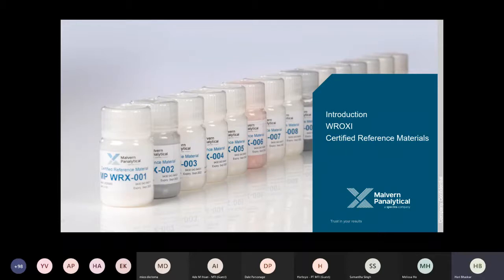I'm just going to move on to Roxy. Given the time, I think we just have to move. So let me introduce the Roxy certified reference materials.